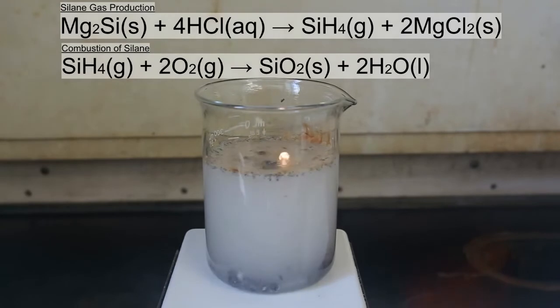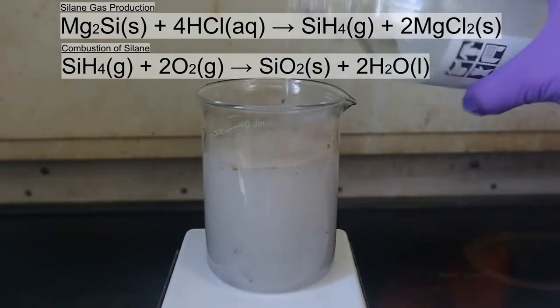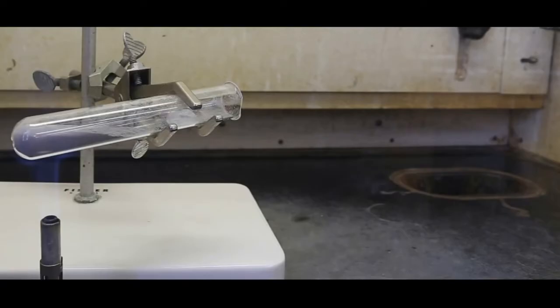The final result was enjoyable, but I decided to redo the experiment using silica gel instead of sand. The silica gel is much finer, purer silicon dioxide. If you choose to use silica gel, you'll need to dry it first. This is because it is hygroscopic and it pulls in water from the atmosphere. The reaction between silica gel and the fine magnesium powder is much more violent, and you should not put silica gel or sand on the top. Doing so could cause the test tube to explode. You must allow the expanding gases to escape somewhere.